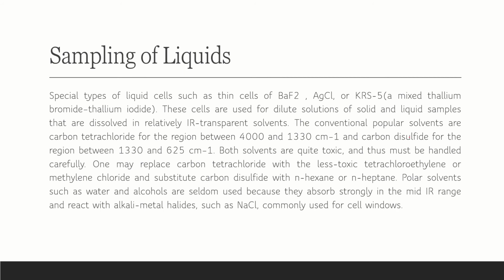So we have selected two solvents that are used: carbon tetrachloride, which is transparent within the region of 4000 to 1330, and carbon disulfide, which is transparent in the region 1330 to 625. But both these solvents are toxic and should be handled carefully. These are the conventional popular solvents.